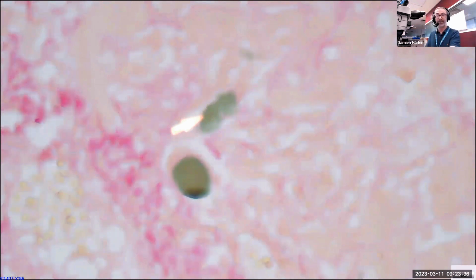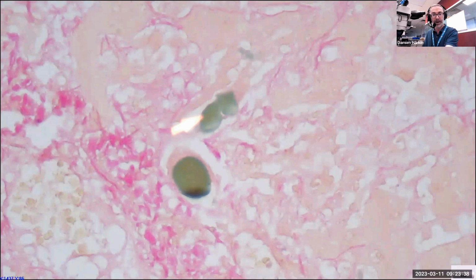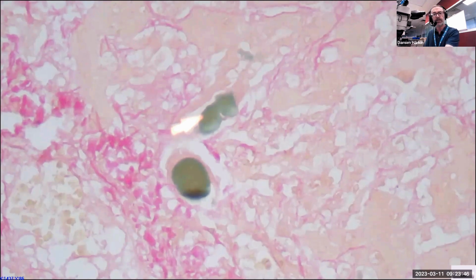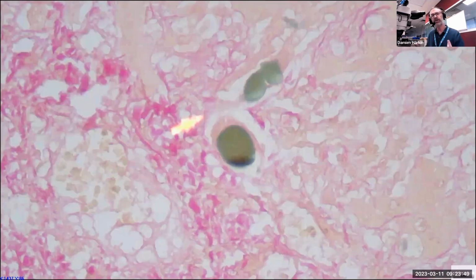still using iron actually, we're exploiting ferric chloride, this time as an oxidizing agent in the presence of trichloroacetic acid. And when combined together, this reagent known as Fouchet's reagent has been around for many years, I think originally used as a way of detecting bile salts in solution. But some very elegant work by Mary Jo Hall back in 1960 basically applied that concept to illustrate bile pigments within tissue sections.